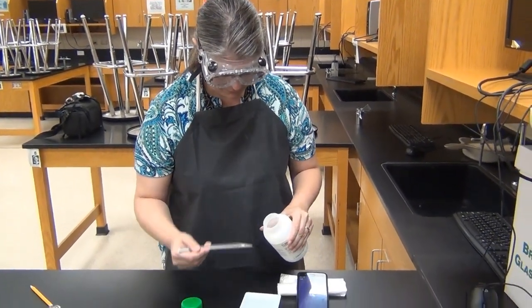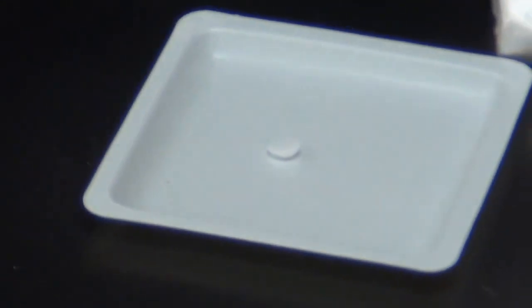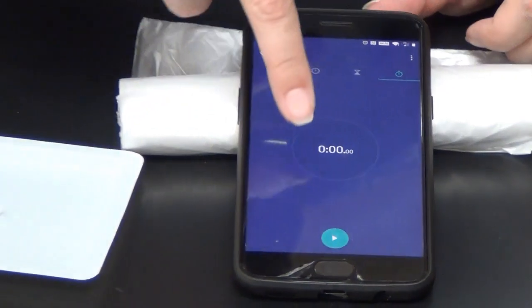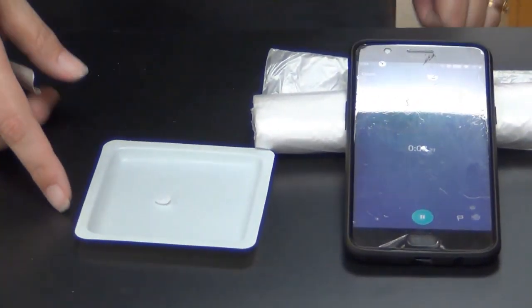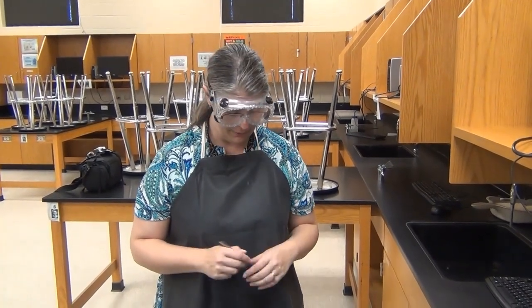The first step is standardizing our sodium hydroxide solution. This is important because the more accurately we know the molarity of the titrant, the more accuracy we can get for our unknown. Some molecules don't make very stable solutions. Sodium hydroxide is hygroscopic — it absorbs water from the air. I'm going to put a timer on here and we'll come back to see what happens to this pellet, showing us why it's very difficult to get an accurate mass measurement for solid sodium hydroxide.